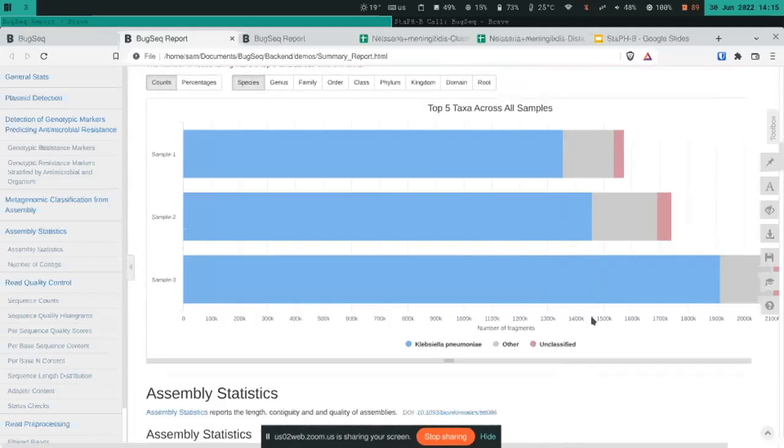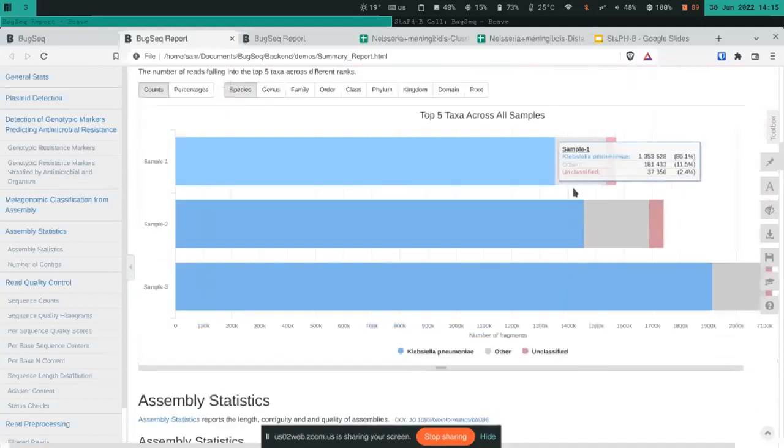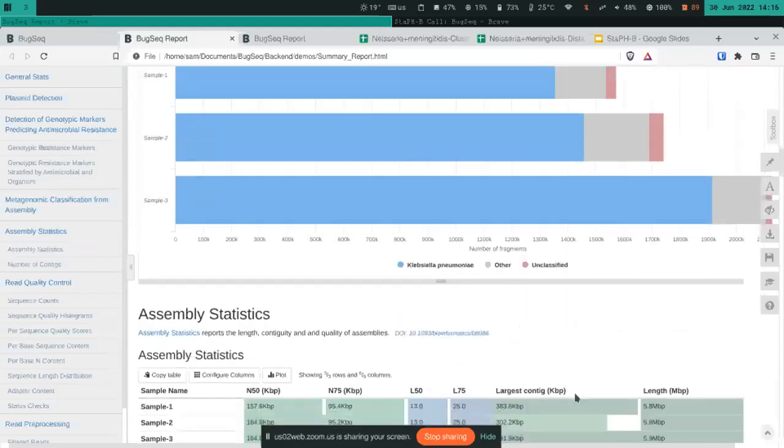The metagenomic assembly, I kind of highlighted that above. So I'm not going to go into classification any further, but we look at what's in the sample. And we have 2 peer-reviewed published algorithms for metagenomic classification. One is a read-based algorithm, specifically focusing on long reads. And then the other one is an assembly-based algorithm looking at short and long reads. And in both of our publications, we showed them to perform better than much of what else is out there, and external benchmarks have supported that. And I'll get into that a bit later.